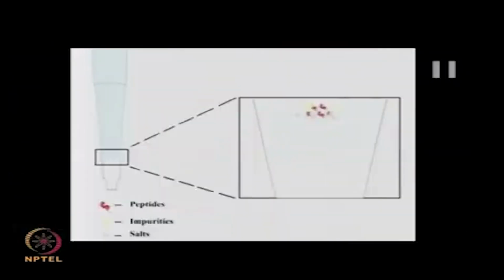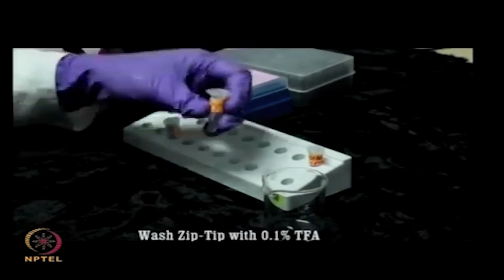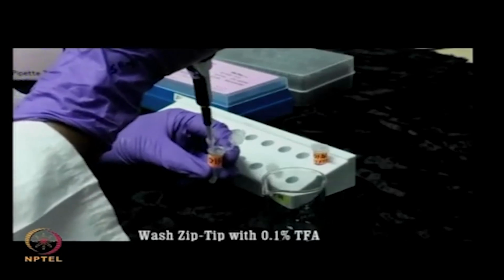First, you need to attach the zip tip pipette tip on top of a suitable micropipette. Condition the zip tip with 10 microliter of acetonitrile. Perform the wash step 3 times and wash it with 0.1% trifluoroacetic acid or TFA.